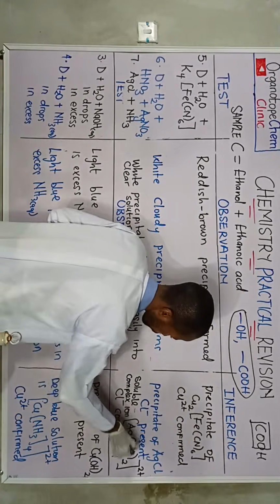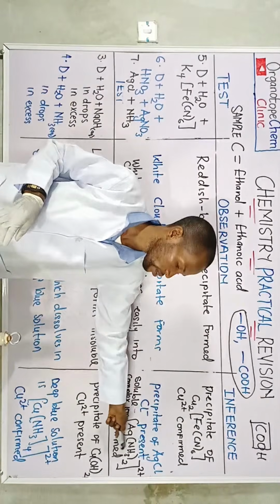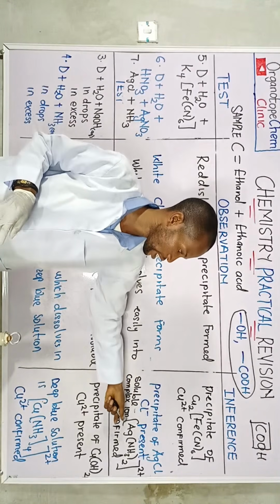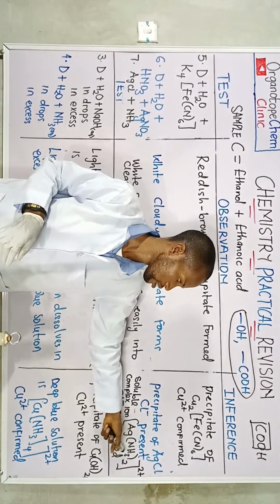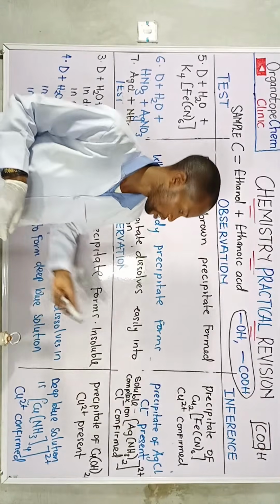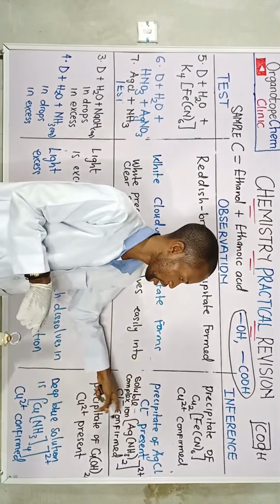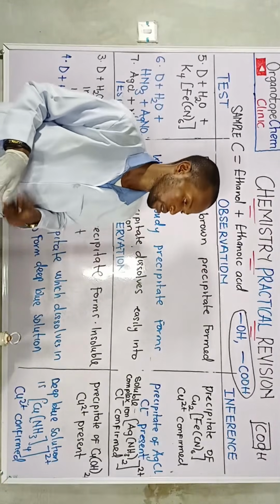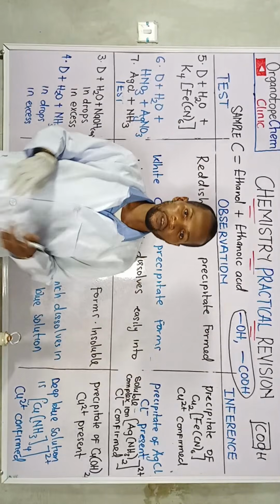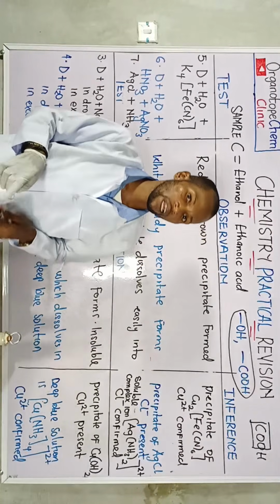ion of, please kindly adjust this. Write soluble complex ion of, then this. Change that to soluble complex ion of [Ag(NH3)2] close bracket, 2 plus. Okay, since it has actually given us a clear solution, we expect to have soluble complex ion. It is no longer a precipitate since it is a clear solution. So if you've actually captured this, type soluble complex ion in the chart.